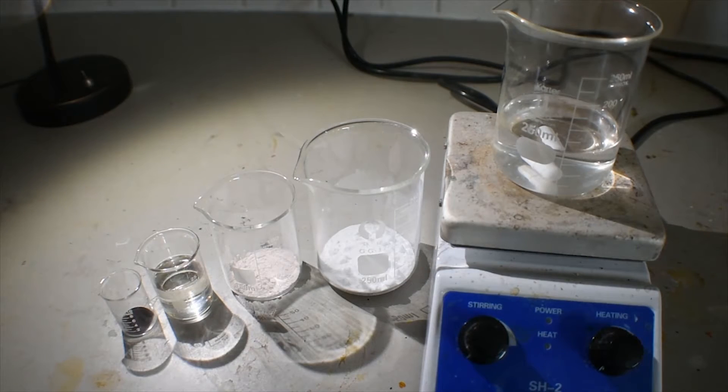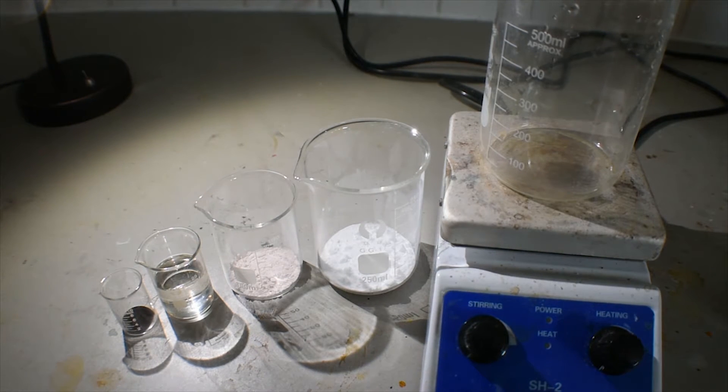I forgot to mention — in addition to this, you will also need a second portion of 12.6 grams of sodium acetate. Because I am doubling the synthesis, I'm going to need 200 mL of distilled water to begin with. So let me go ahead and measure that out.